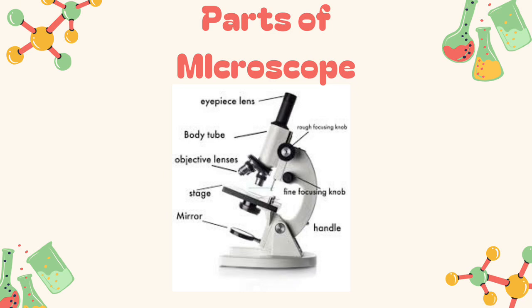Next one is the light. It provides illumination so the specimen can be seen clearly. Next one is the focus knob. Adjust the focus to make the image sharp and clear. Next is the arm, and lastly the base. It provides stability and support for the microscope.